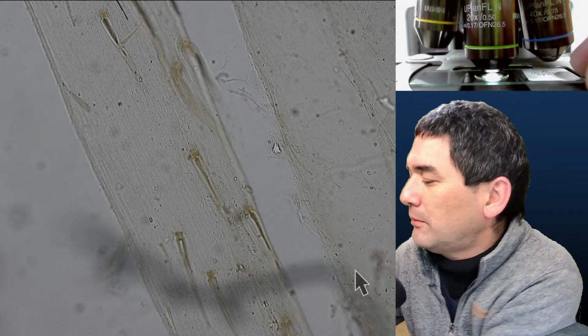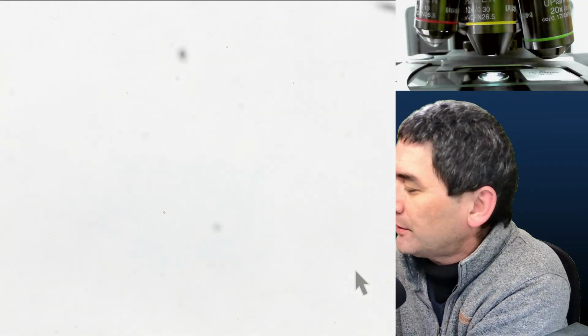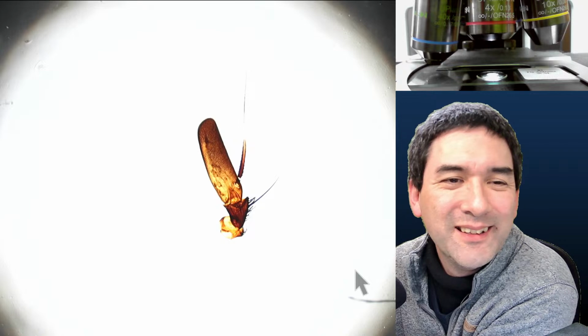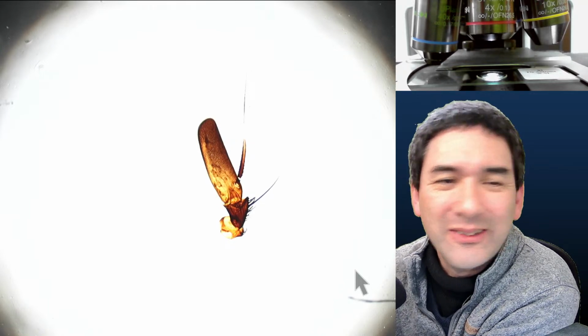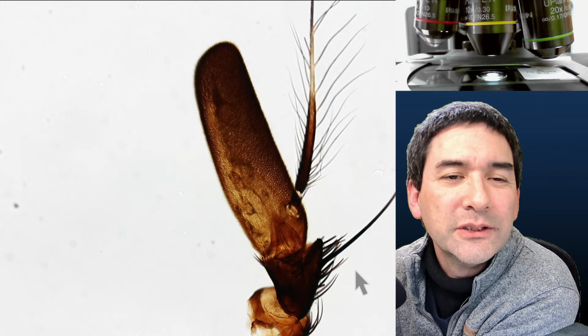Okay. So these were basically the butterfly legs. I still have quite a few to go. A fly antenna, whole mount. Let's have a look at this. Okay, so again I have to find it. Is this it? Come on, nah, I don't know. That's interesting still.